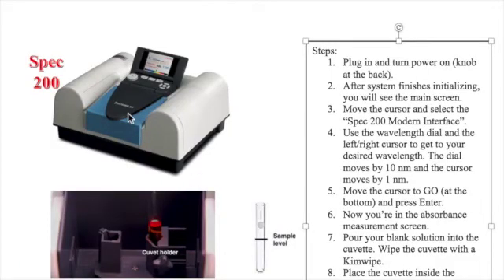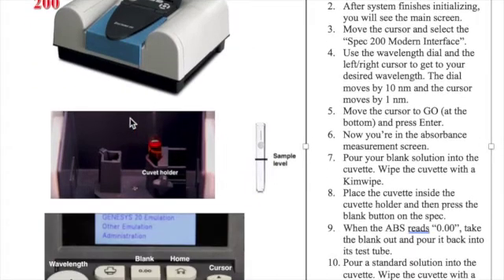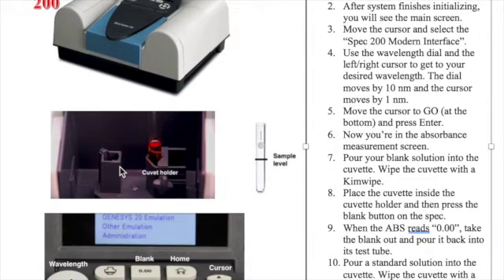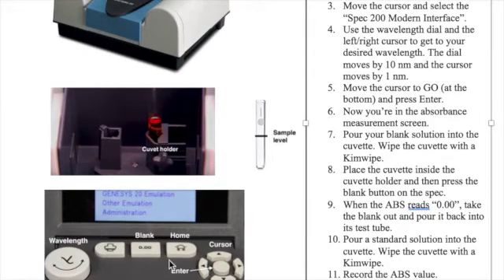The spectrophotometer you will use is called the spec 200. The blue cover can be opened to reveal the sample compartment shown here. The controls on the spec are shown here with all the different knobs and buttons.